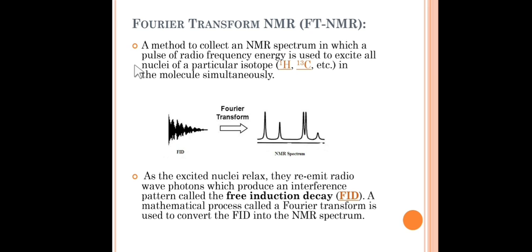For example, if we are observing C13 and have 5 carbons in one molecule, all the carbons are excited and relaxed at the same time.